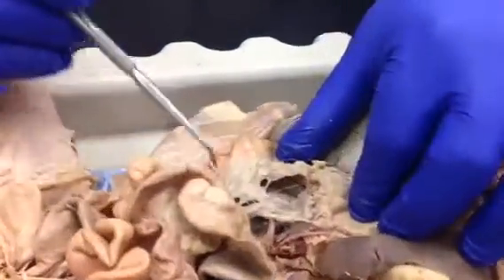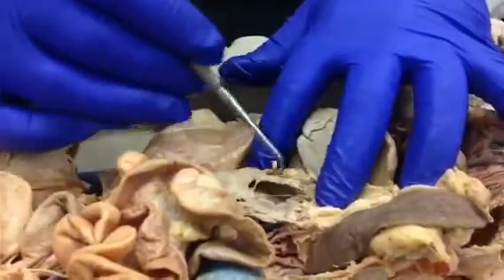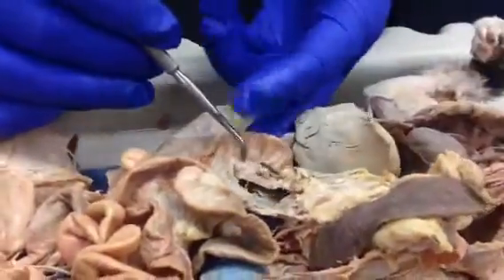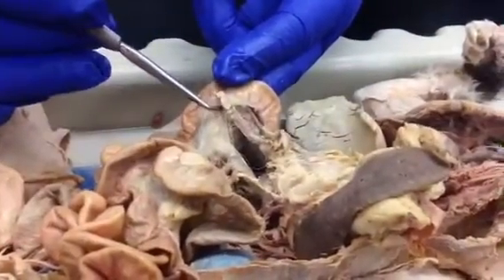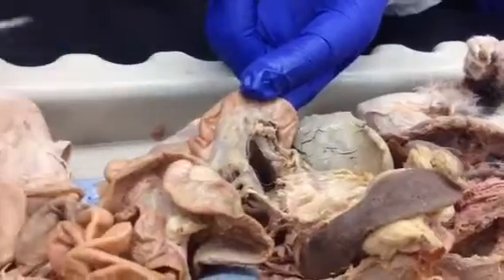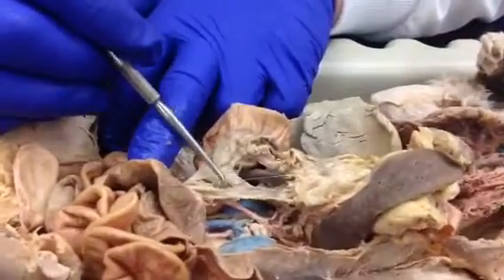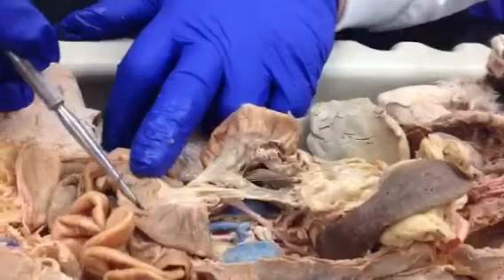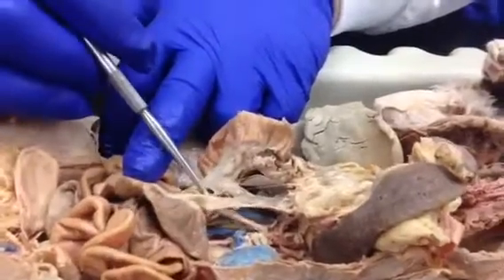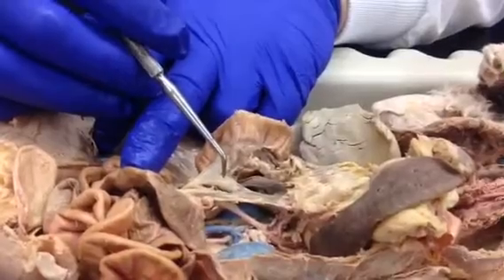The only other thing to do is just, if you push the pancreas around a little bit, you'll see these big arteries and veins that are right here between the pancreas and the duodenum. Those are all pancreatic duodenal. There's 4 of them, so we just call them pancreatic duodenal. And if this were intact all the way, I should be able to find a small branch, like, oh, that might be it right there. A small branch of the veins going over to the large intestine, and that'd be the inferior mesenteric. But again, I'd wait until I find that yellow one. That's a lot easier to follow.